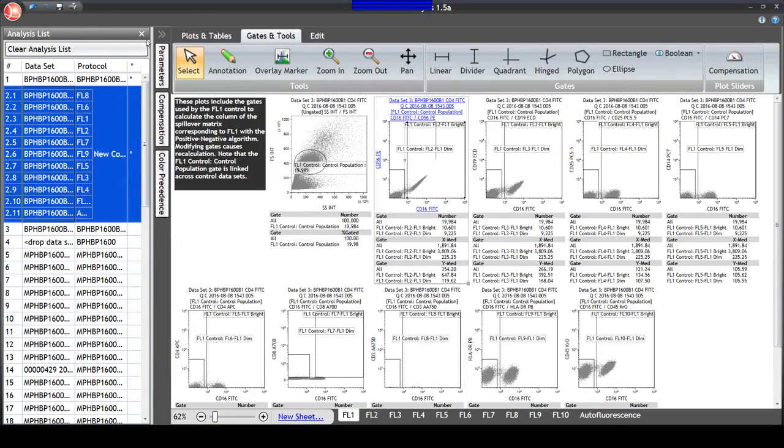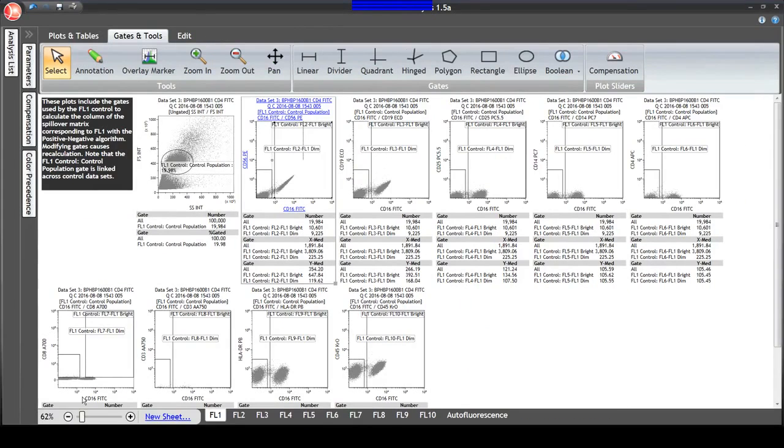So let's go back to this compensation. So that's reflected here. While the FITC is the same across the bottom of the plot, you'll notice on the Y that the populations are not in the same place. So these are kind of high because chrome orange is kind of dim. These are kind of high because PAC blue is kind of dim. They're both excited by the 405. These are smashed up against the axis.